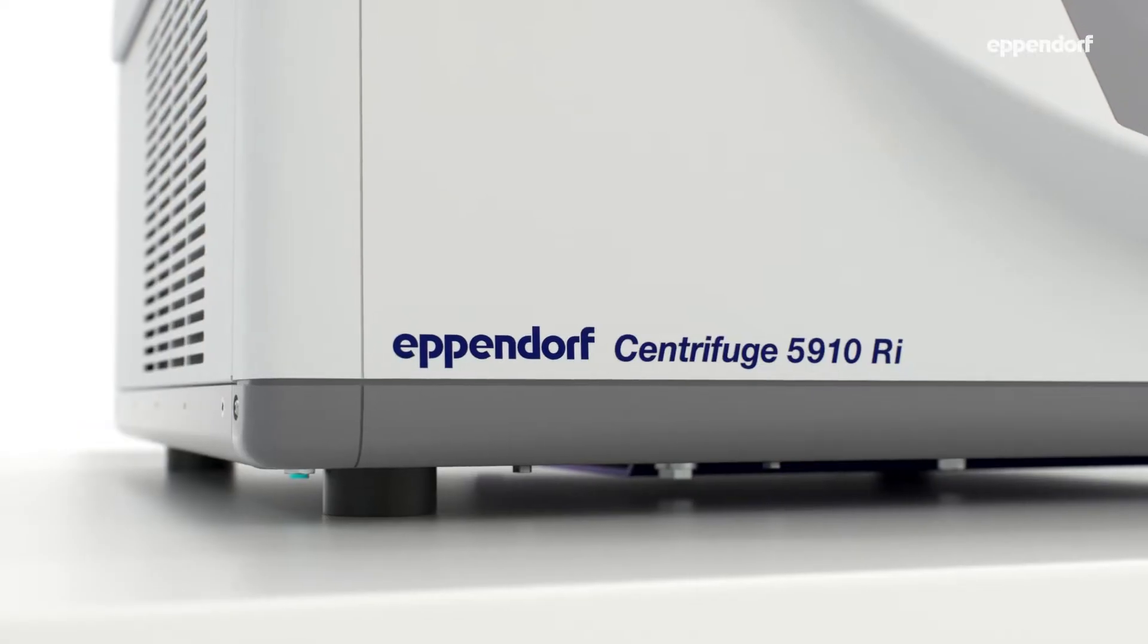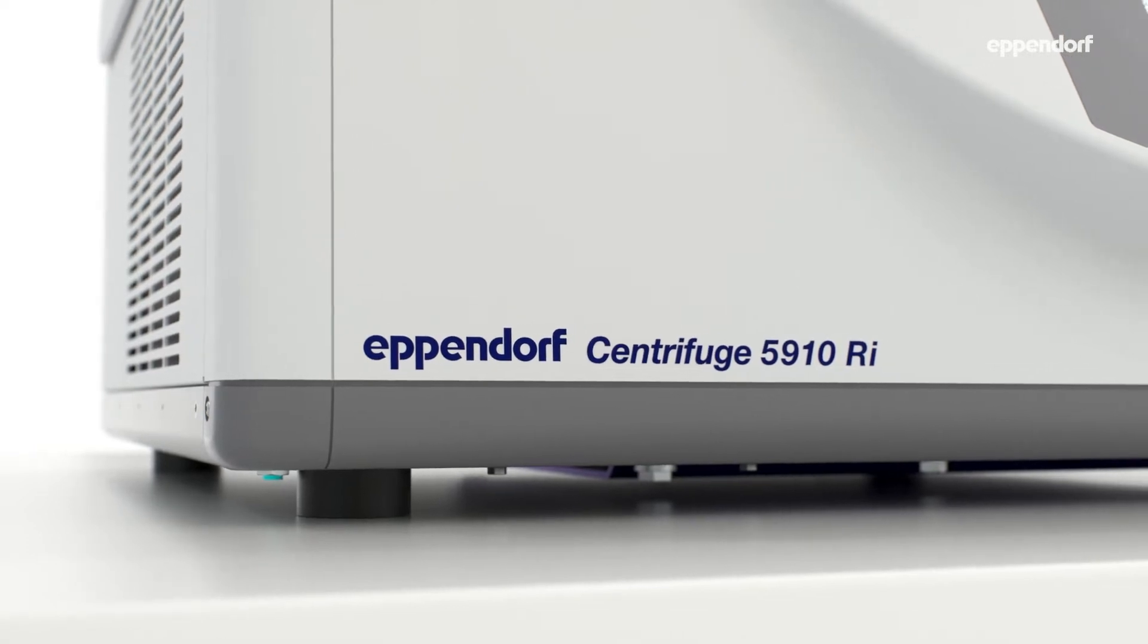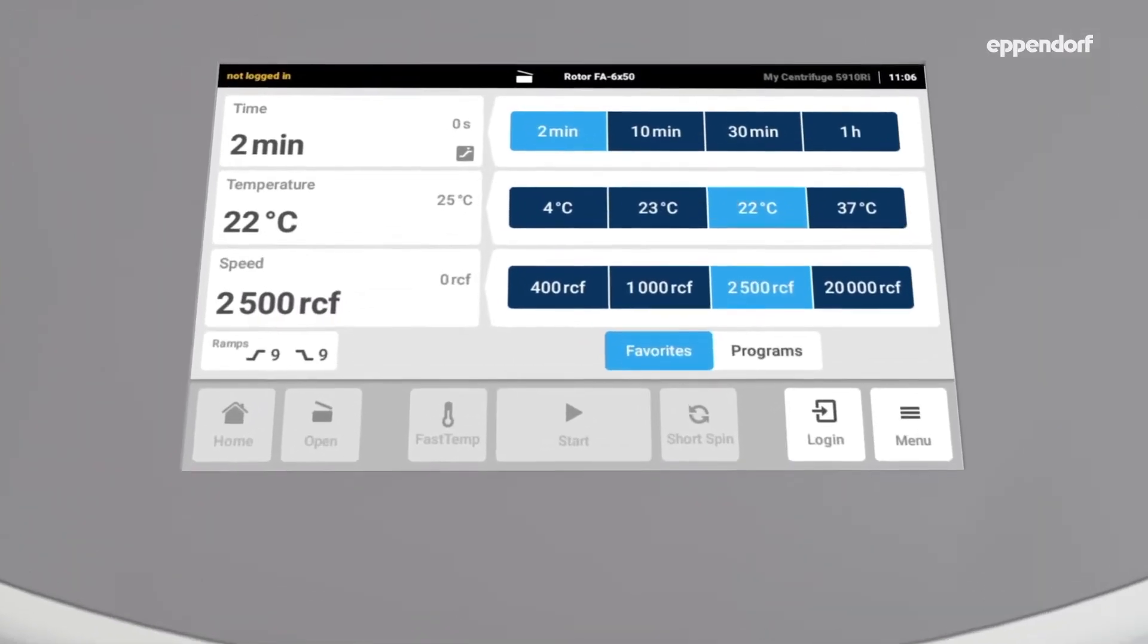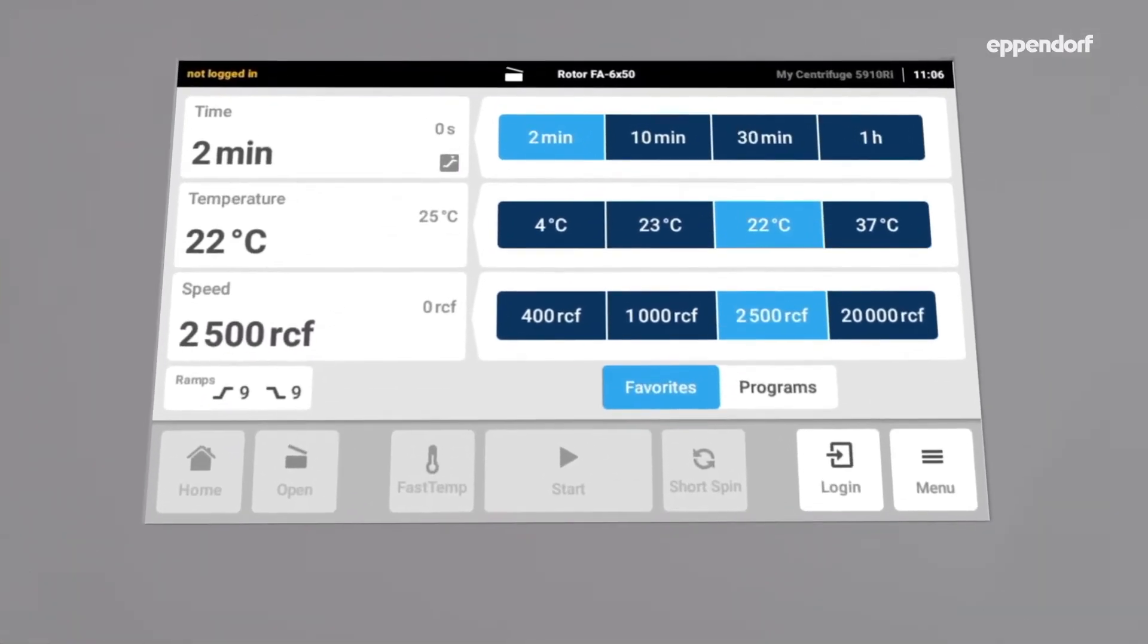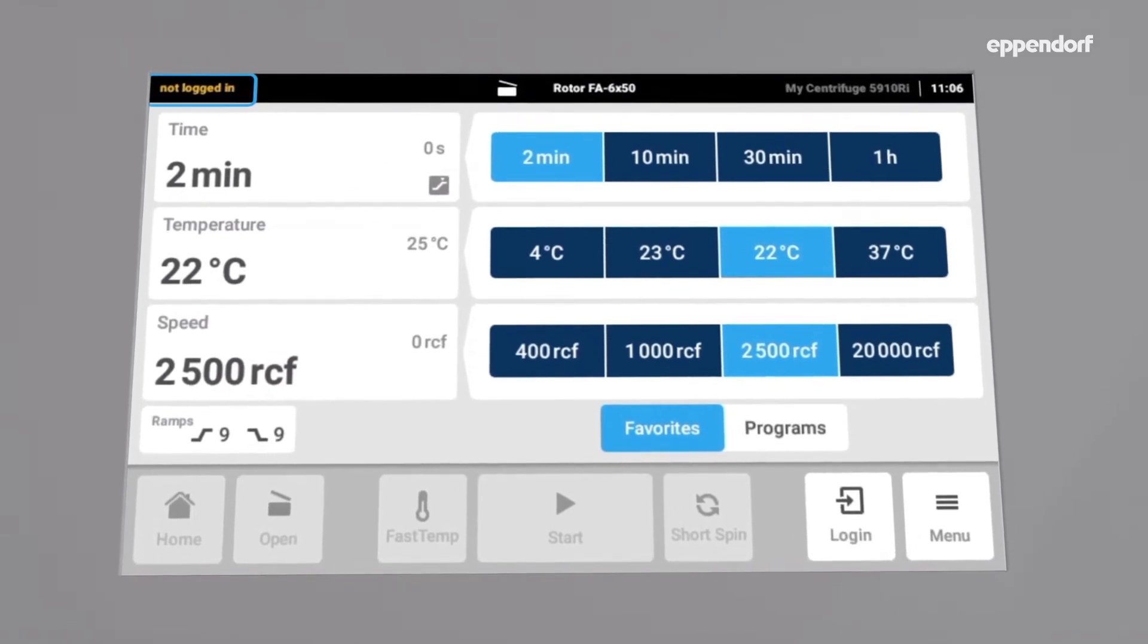Centrifuge 5910 RI comes with a three-level user management. When switching the centrifuge on, no user is logged in by default.